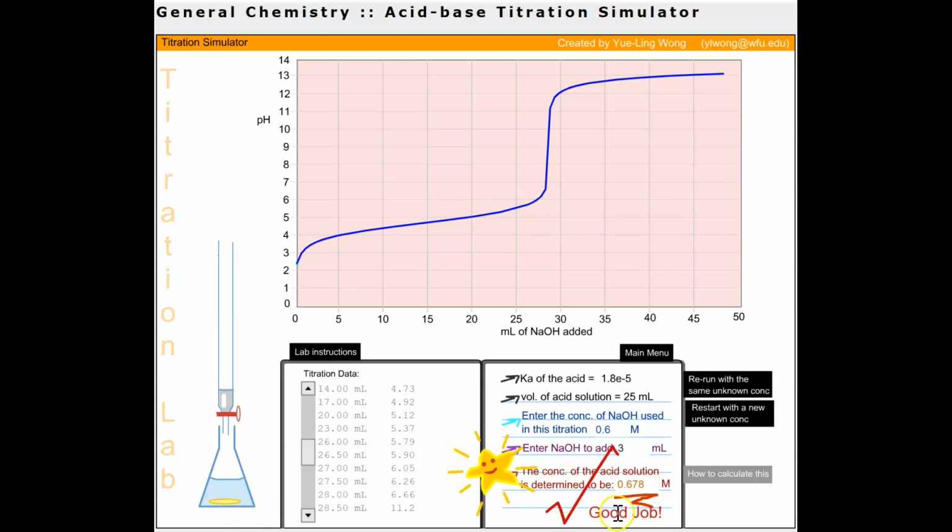and hopefully you'll get a nice check mark. If you've done your stoich correctly and you put in your solution, you should get this beautiful star sticker, and you should be very proud of yourself. Screenshot this and include it in your lab report.